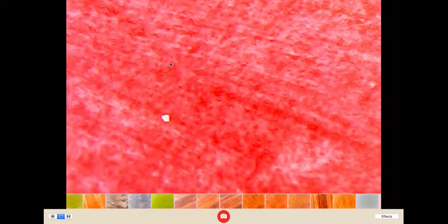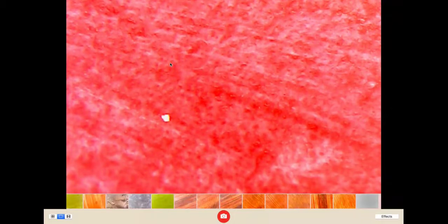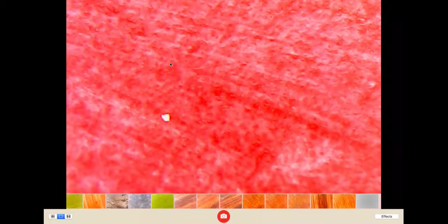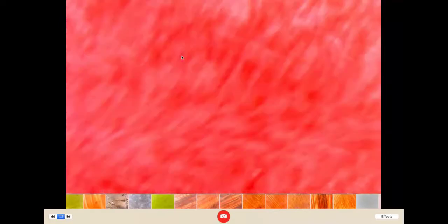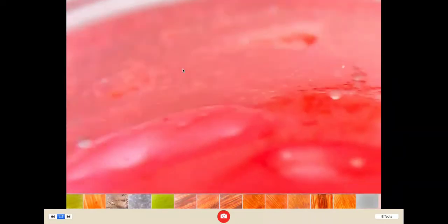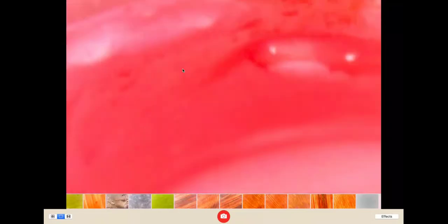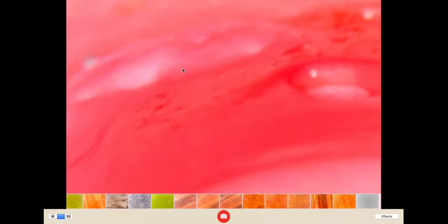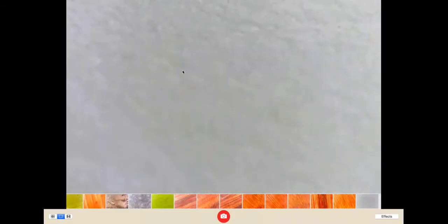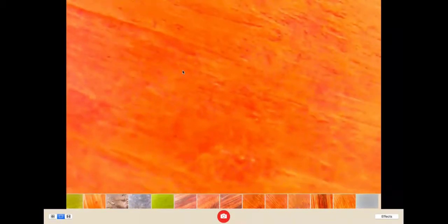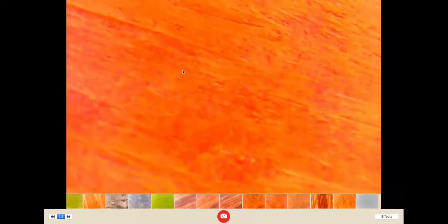The petrolatum formulations I'm using can vary markedly in terms of viscosity and color. The one I'm using is an oil and water emulsion. Let me bring that up if I can give you an idea of what the petrolatum looks like. There it is, we're looking at the surface under magnification. It's opaque colorless, and some can vary, some can be light yellow depending on what I use. Here's the paint sample, bring that in. We're looking at the surface of the paint itself, the emulsion. I haven't stirred for a few minutes, but that gives you an idea of the type of research I'm doing.